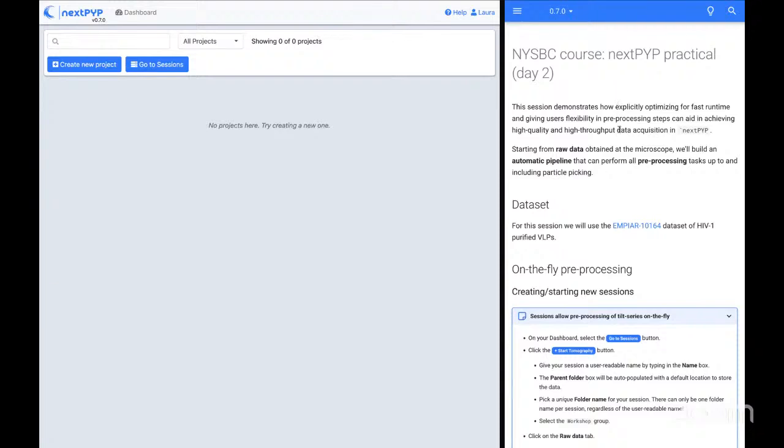Okay. So this morning I'm going to do basically a condensed version of the pre-processing that Abby showed yesterday. So you guys should all be experts by now, and this will be a breeze, right? I'm just going to walk through it so you can just sit back and observe. And if there are any questions that came up yesterday during pre-processing, hopefully this addresses them.